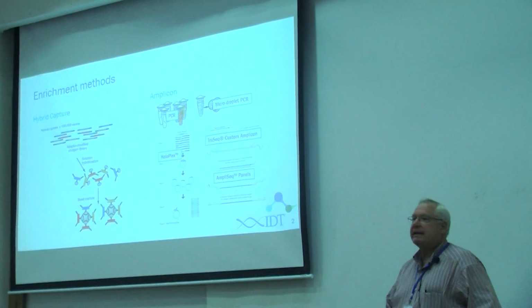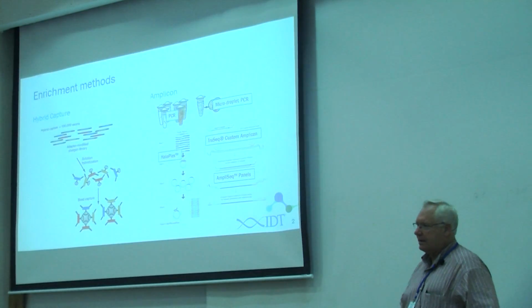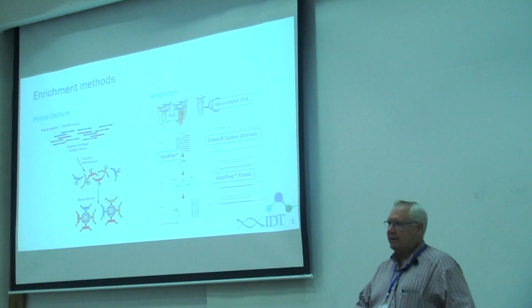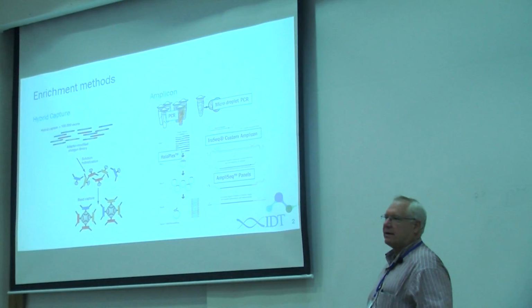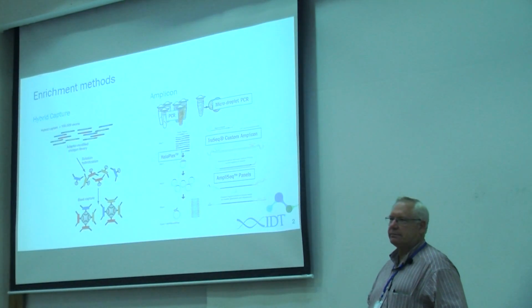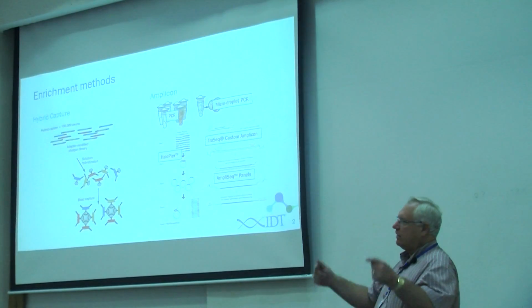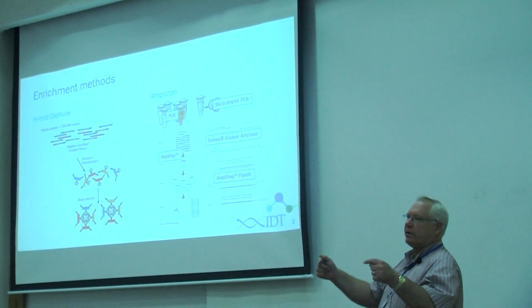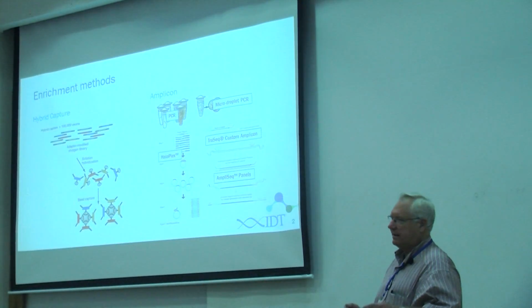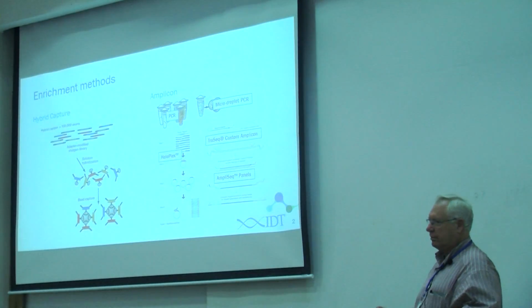And it's the easiest way to do it. Anybody can do PCR. It works well on small input amounts of DNA, which is very friendly. It also is going to miss a lot of stuff. Because, especially if you're working in cancer, you're going to have rearrangement events and things. And if the two primers don't lie right where you expect them to, you do not get a product. And so you will be missing things by amplification-based sequencing. It's not theoretical, it's unavoidable.